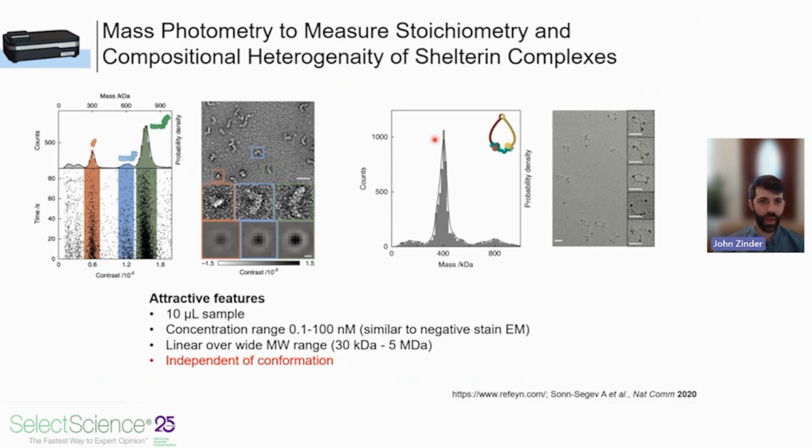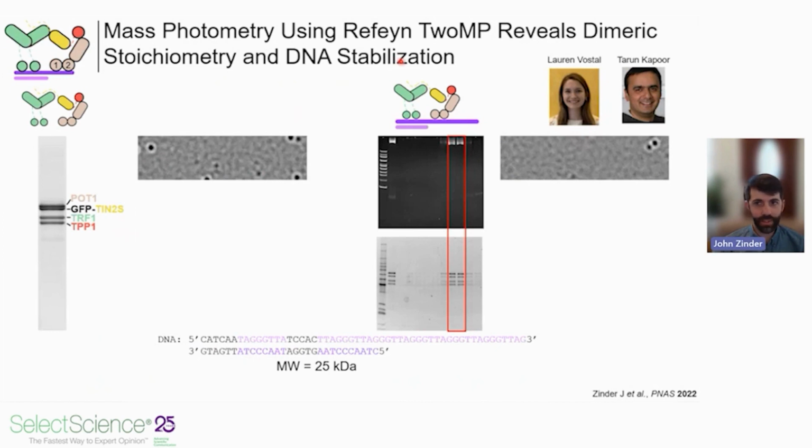So this is sort of going back to an earlier criticism of the work from others, where if you see heterogeneity in EM, how do you know that it's conformational heterogeneity and not just compositional heterogeneity? And so I teamed up. This technique was suggested to me by Tarun Kapoor, and I teamed up with his graduate student Lauren Vostal, who trained me on the instrument.